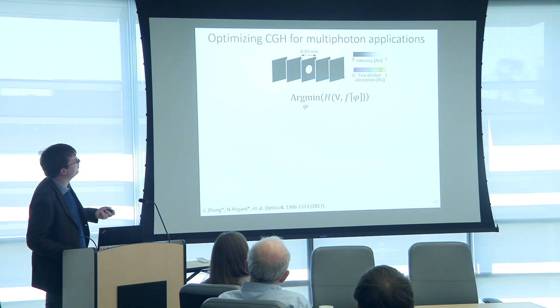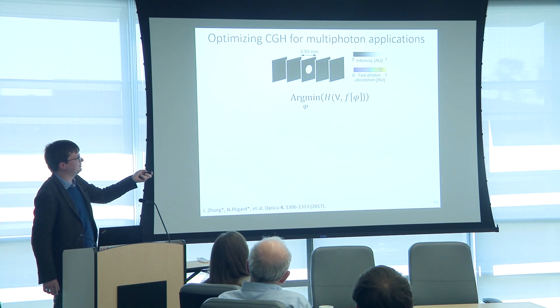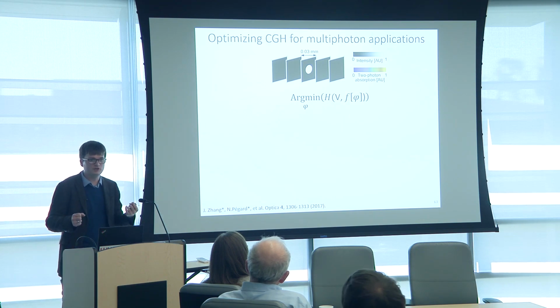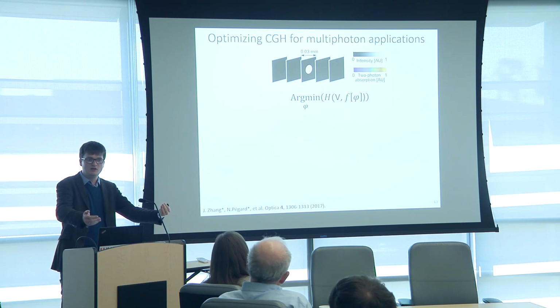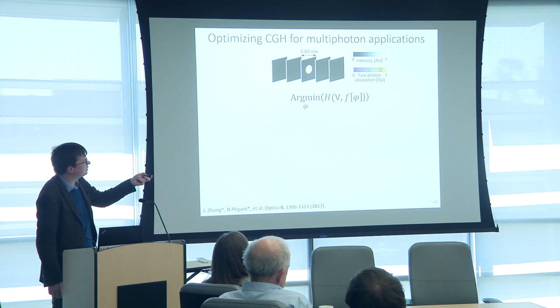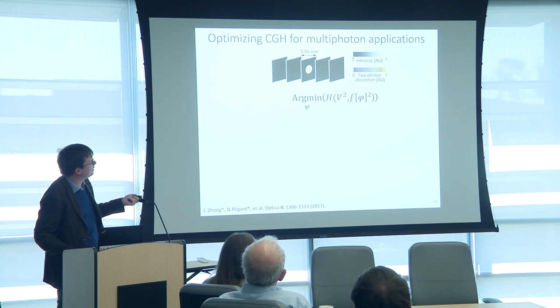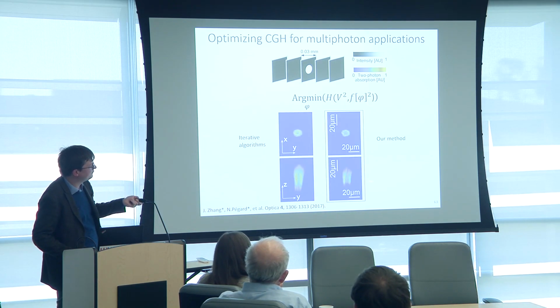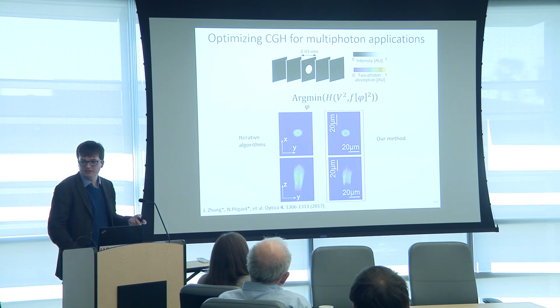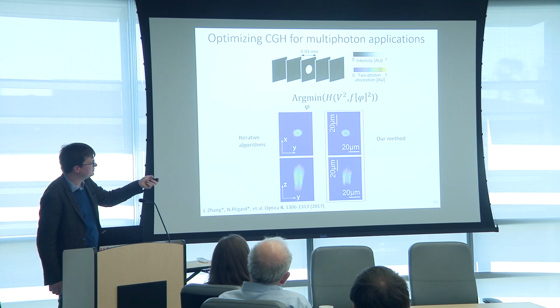So for instance, an example is if you optimize here by saying that your cost function should value not the output intensity, but the output two-photon excitation. You just turn the cost function to optimize not for the intensity, but for the square of intensity. And you can make holograms that enhance the confinement along the z-axis by specifically targeting that. You're trading off some of the uniformity of the image. This is not really a blob.